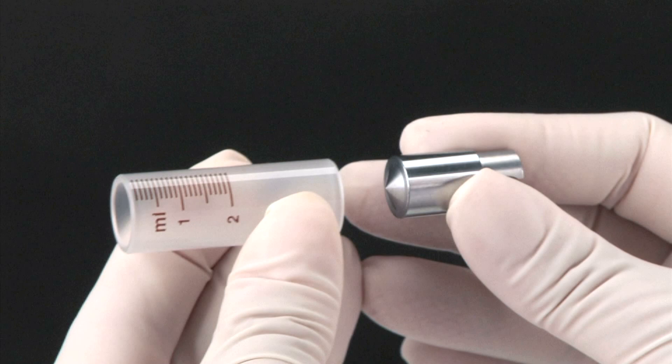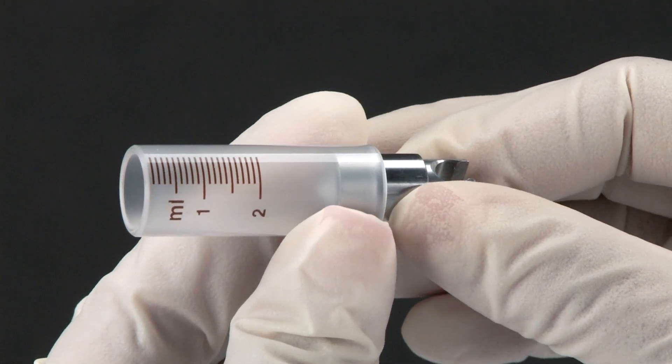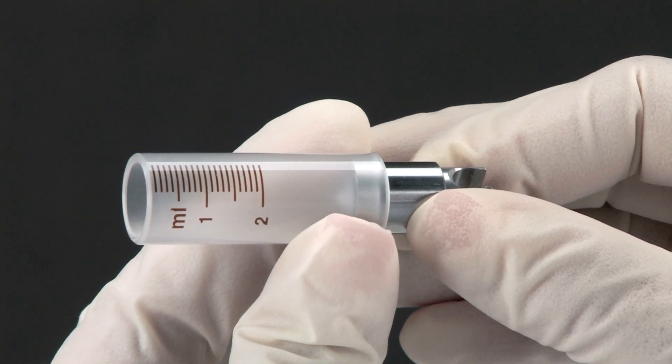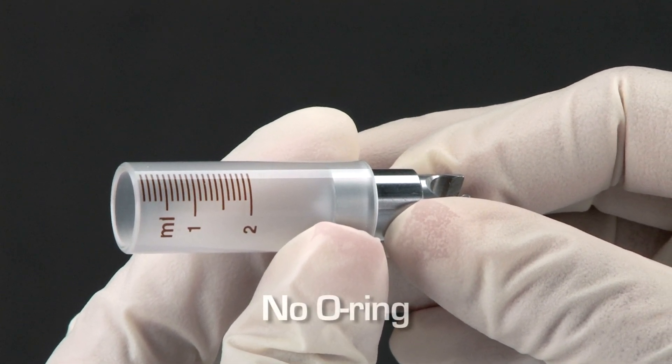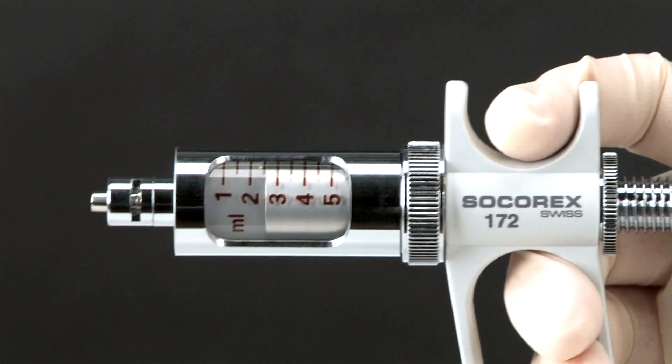At the core of all Dosus syringes are precision machined stainless steel plungers, moving inside precision bore and graduated ground borosilicate glass barrels, which form a liquid-tight seal without the need for o-rings. Both elements are housed in a robust metal body.